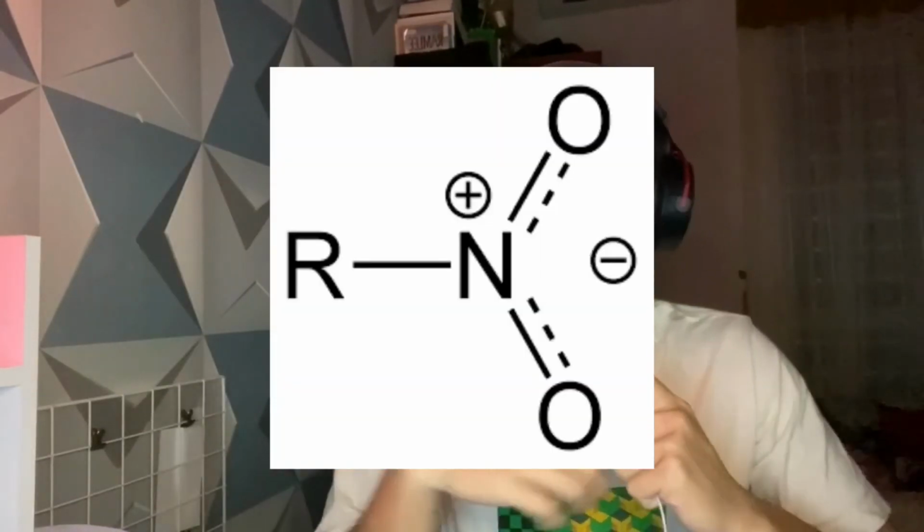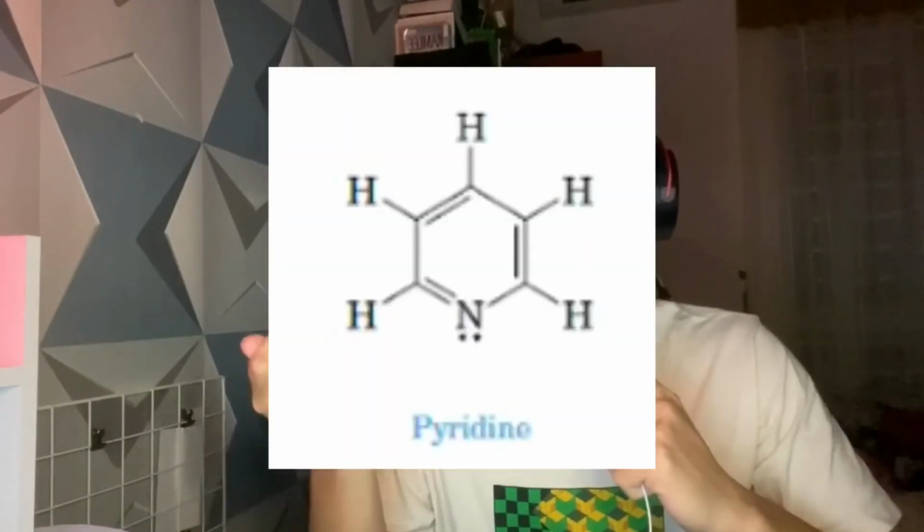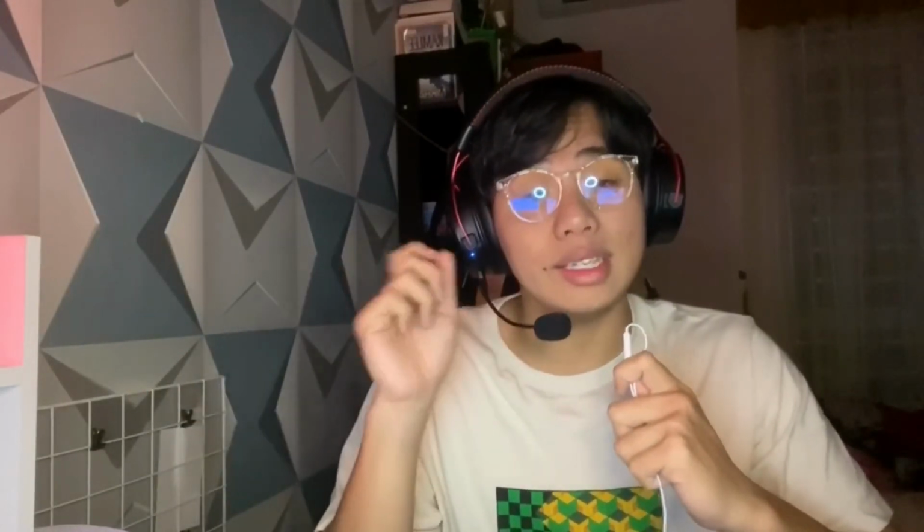However, the Kjeldahl method is not suitable for compounds containing nitrogen in azo and nitro groups or in rings such as quinoline, pyridine, or nitrate, as the nitrogen cannot be converted to ammonium sulfate, which is compulsory in the Kjeldahl method.